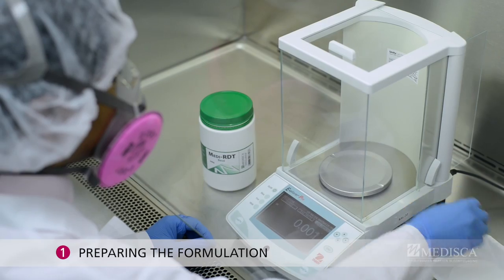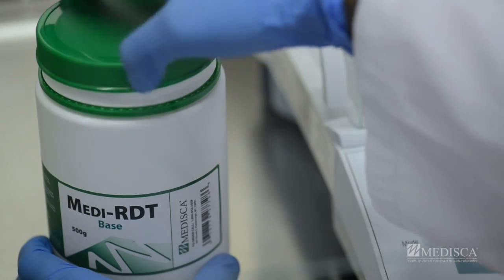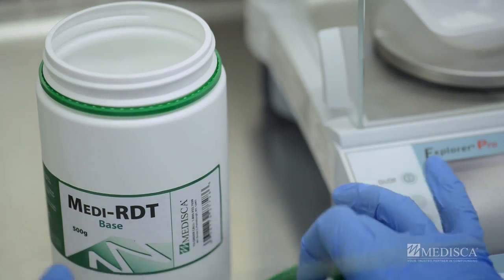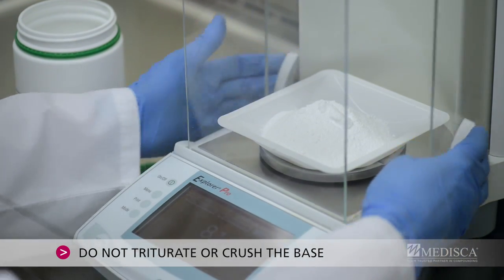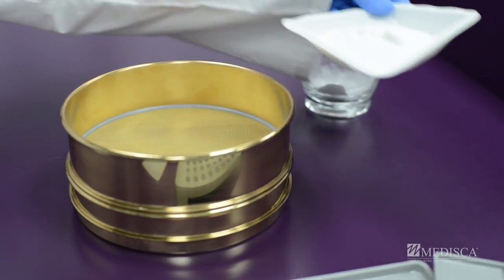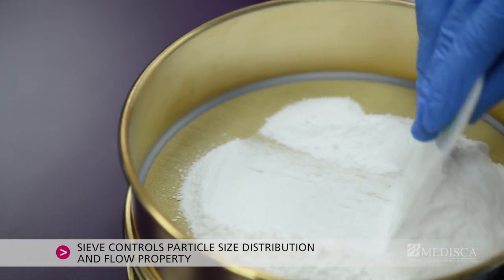Step 1: Preparing the formulation. Weigh all the ingredients, then triturate the APIs and other ingredients including a suitable flavoring agent. Do not triturate or crush the base. Next, pass all the ingredients through the 50 mesh sieve to control particle size distribution and flow.